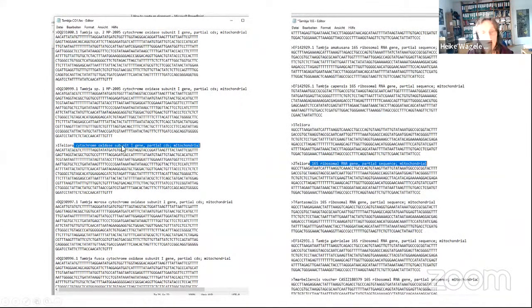So I have 1 T Eliora here, CO1, 16S. Here is the 2. I have a second one. I already called it 2 T Eliora, and this part can also go away if I don't want to get mixed up. But be sure that you don't lose this information later on, also with the accession number, because the accession number has to be mentioned in your publication for this specific sequence.